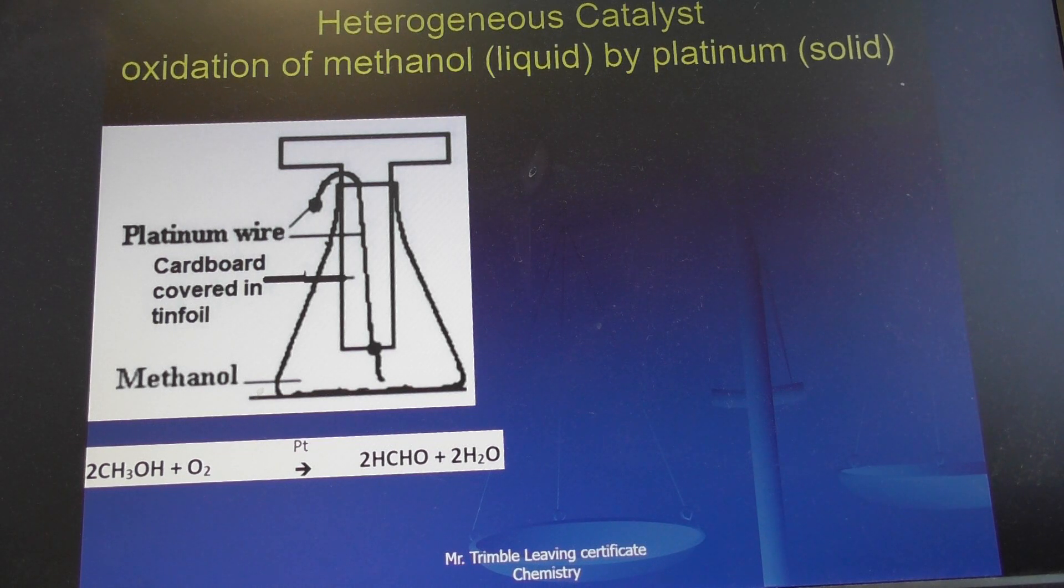It's a little wire of platinum that's attached or clinging to the tin foil which wraps around the cardboard T-piece. The tin foil will effectively prevent the cardboard from being burned. Then you have methanol placed here at the bottom as a liquid.